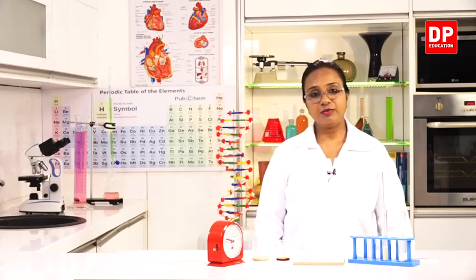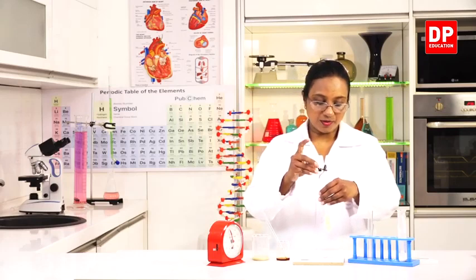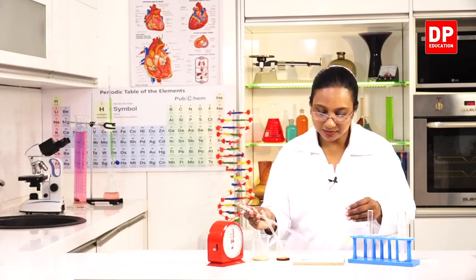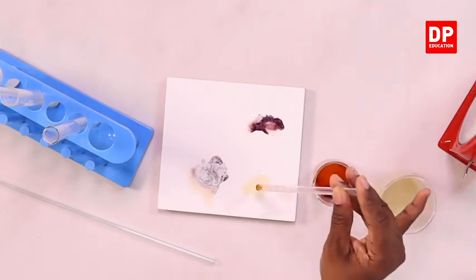Again, we will have to wait for another 2 minutes to observe the next color change. Now, end of 4 minutes. So, we will take another drop from the reacting mixture. I will place it here. And to this again, we will add iodine.